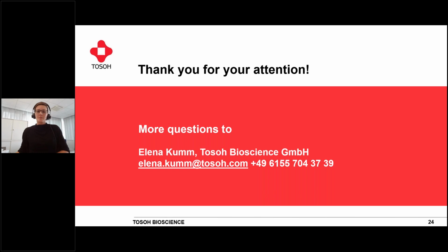Sorry, I didn't completely answer the question. For ion exchange, how do you determine whether you need a strong or a weak cation exchange column? That's the tricky point, right?